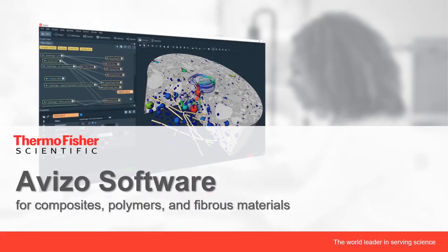During this presentation, we'll feature Thermo Scientific Avizo Software for composites, polymers, and fibrous materials. We'll explain how it helps more than 3,000 researchers, academicians, and industry professionals around the world to better know their advanced materials thanks to dedicated features developed by our experts in close relationship with the scientific community.